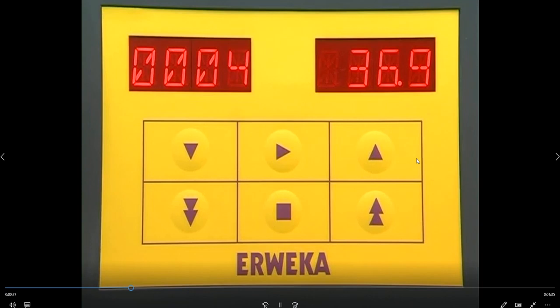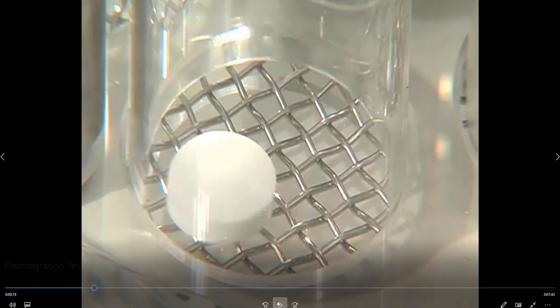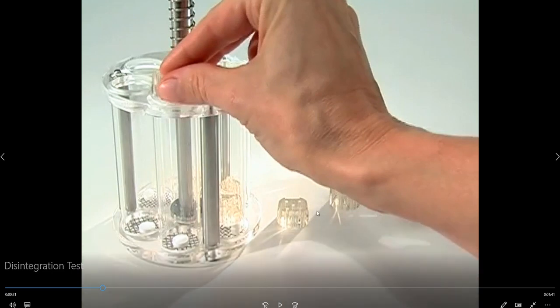You will see here a plastic disc. Okay, let me go back. Okay, you see here plastic discs. This disc can be used only when the pharmacopoeia is specifying its use or when it is necessary. These discs are intended to keep the tablets under the medium. Sometimes if you don't add this disc and you want to operate the machine, the tablet remains floating, always floating. It doesn't go inside the liquid, and that is wrong.